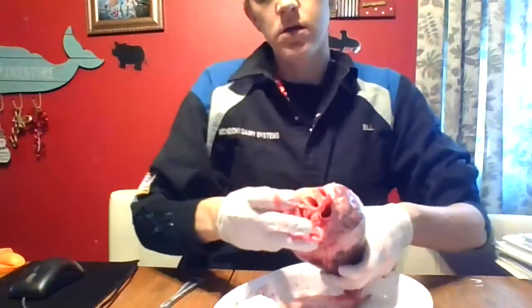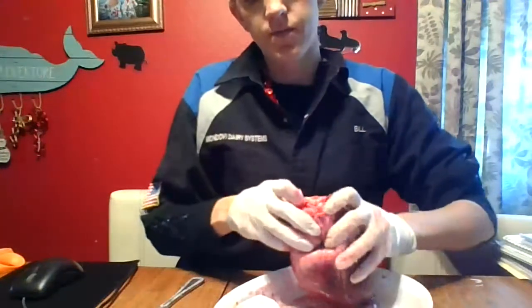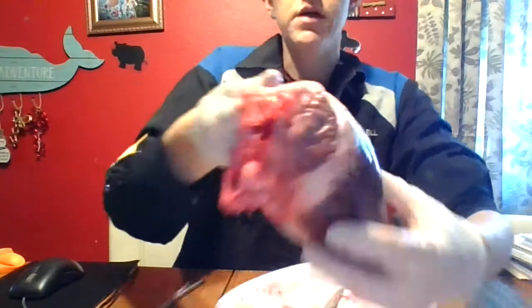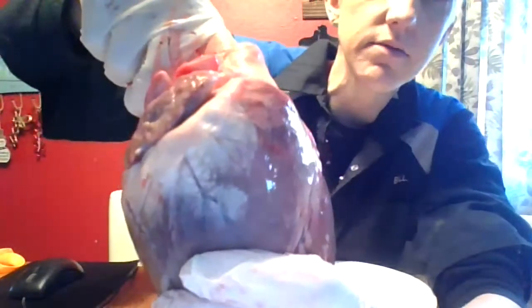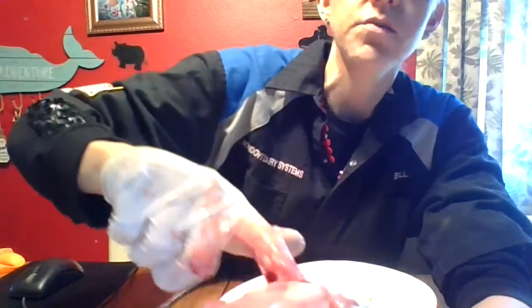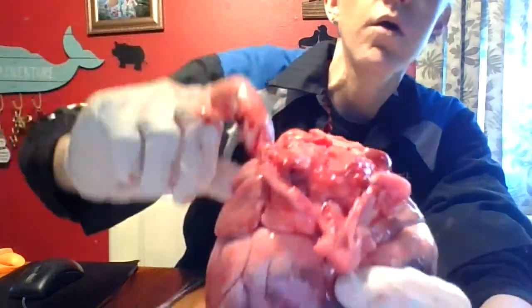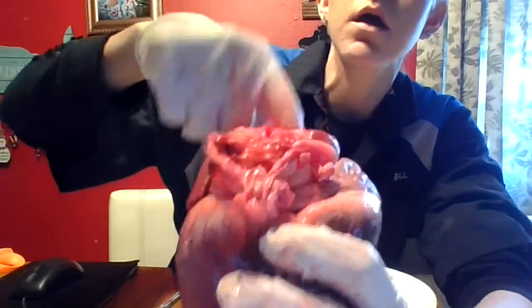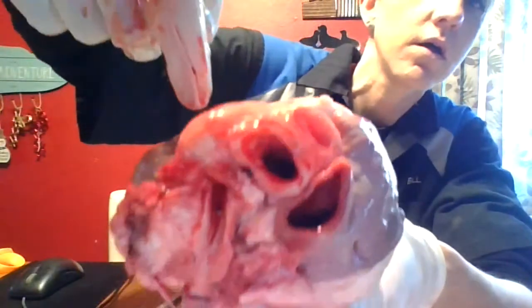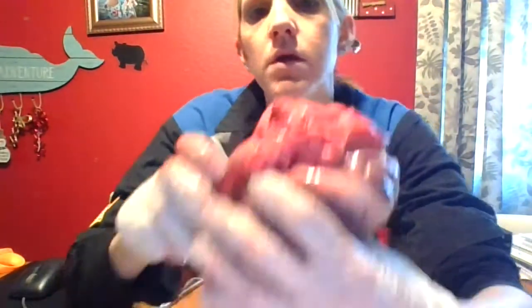And then over here you have the pulmonary artery — shove your finger in there. This is the pulmonary artery because all arteries leave the heart. So the pulmonary artery leaves the right ventricle. When I cut that open, you'll be able to see that better — I just want to show you it on the outside. See how those are all kind of together there? And this is the aorta right here — see how big those are? My fingers fit right in. The aorta leaves the left ventricle.